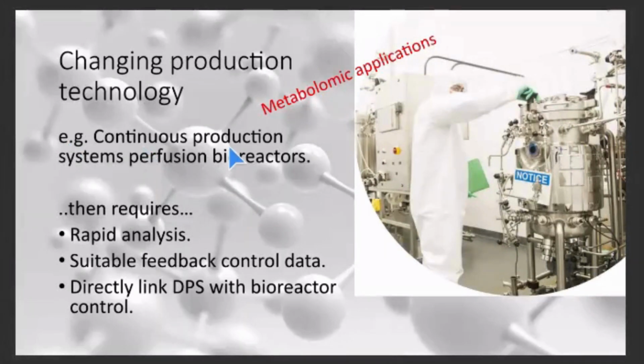Instead of batch reactors, we're now moving to continuous bioreactors. Modern types of microbial and single cell production systems can operate very quickly, so we need rapid analysis. We need to get feedback of our data so we can control the system with computer systems. And often we may want to understand how the downstream processing can be optimized by tweaking the bioreactor processes.